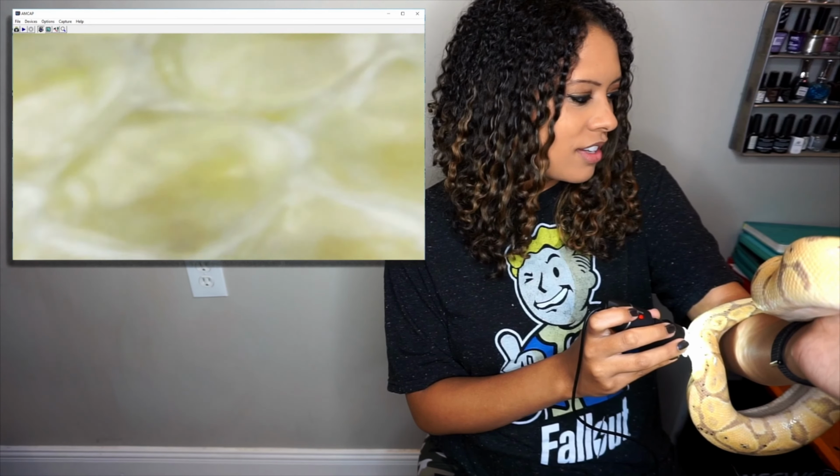So already on her arms, you can see that that's a different kind of scales there. And then let's do these spikes along her side. We'll see what those look like. Sorry guys, most of this video I'm probably going to be looking away because this thing hooks to the computer and I'm looking at the monitor to make sure I'm recording what I think I'm recording. So that's what her spikes look like.